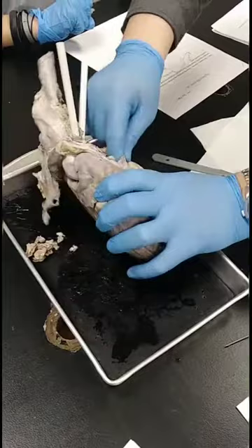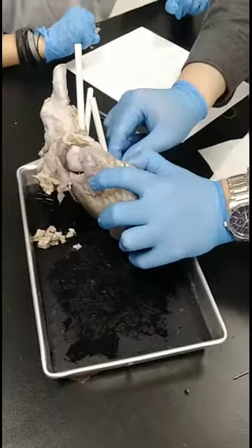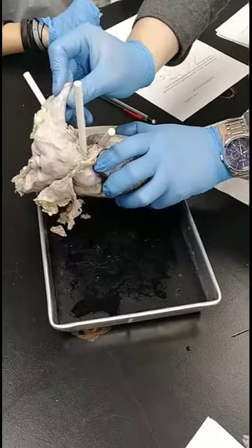Okay. Here's another blood vessel. Use another probe. Get that marked. All right. And when you open this up, you can see where these are going. Here's the vena cava right here. Because it's not connected to the pulmonary trunk, it's going into the heart. Make sense? Okay, so this is your anterior side, this is your posterior side, and that's the vena cava right there going into the heart. It's very thin compared to the aorta trunk up here. Right?